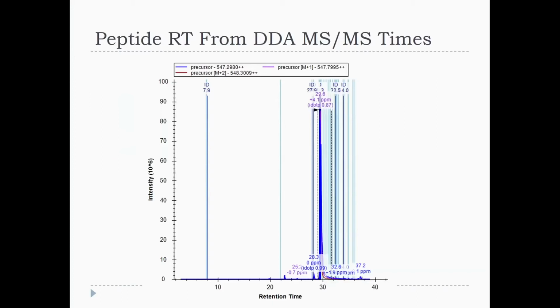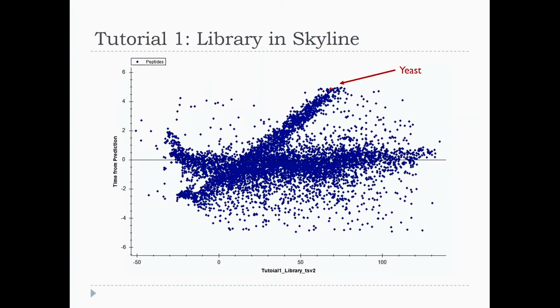That might cause me to say, oh, I predicted it at 20 minutes because that's the mean. But then I switched to the median, but because of tailing, there were some things where if you use the median, they'd end up way out here, not anywhere close to the apex. So you can see it can get very tricky trying to pick an IRT retention time from a set of spectra. I think I've really improved things a lot, but it's by no means a done deal.